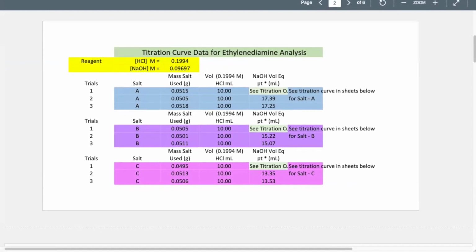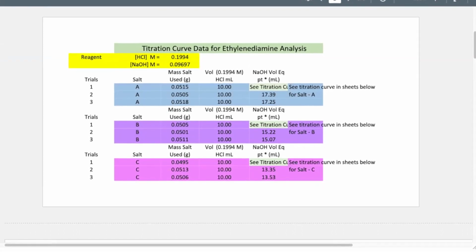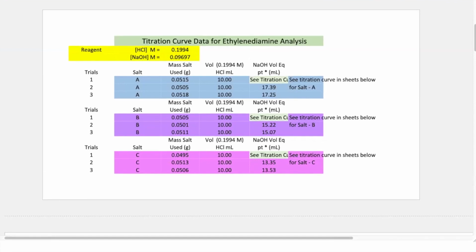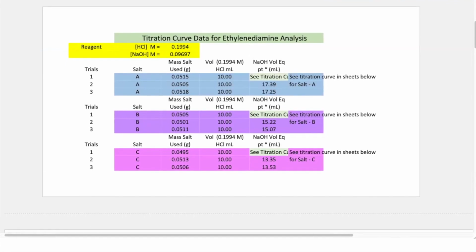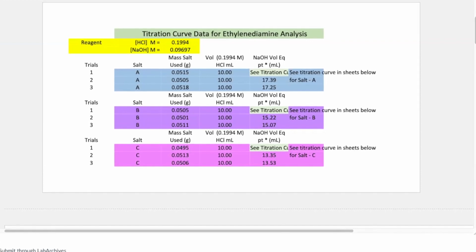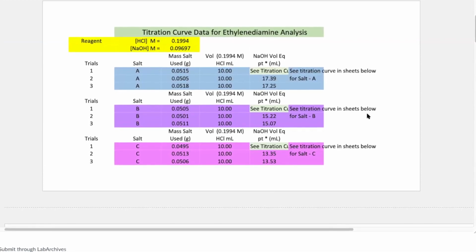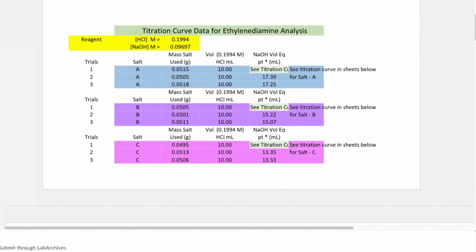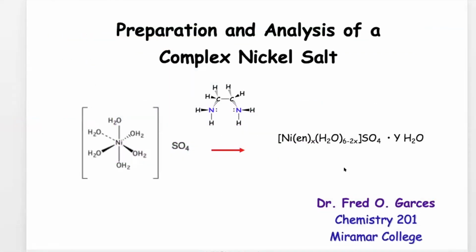So let me go ahead and do the synthesis part. Let me share the PowerPoint with you, and you will see this PowerPoint again in the video so that you have an idea of what exactly is going on in this experiment. So this is the preparation and analysis of the nickel salt.